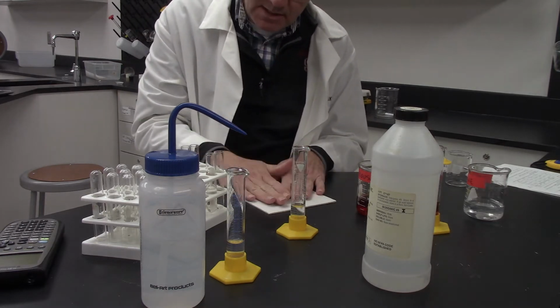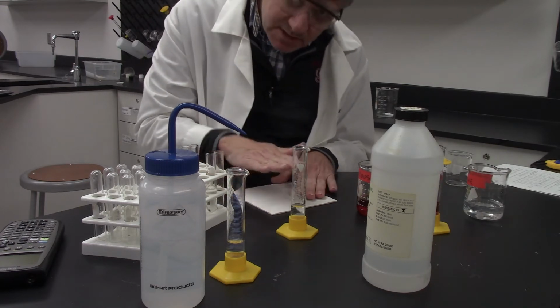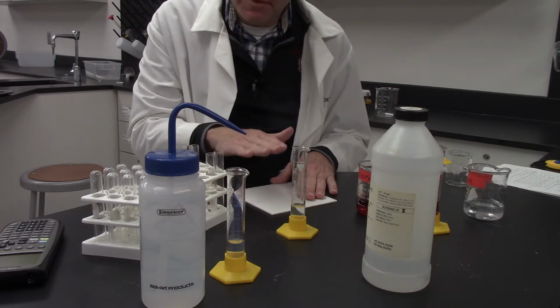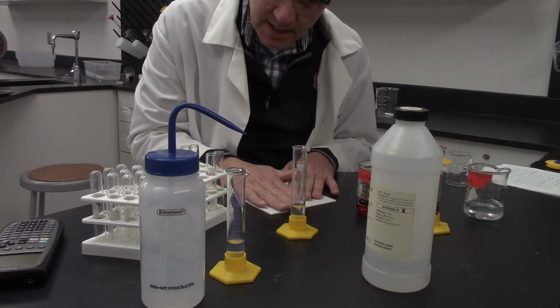That's going to be our indicator. We know the initial concentration of the iodine, and we're going to measure how long it takes for the reaction to stop. From that, we can calculate the rate of the reaction based upon the iodine concentration.